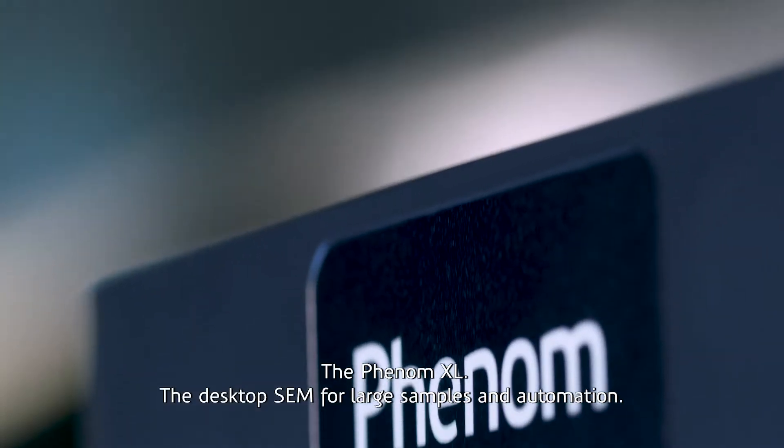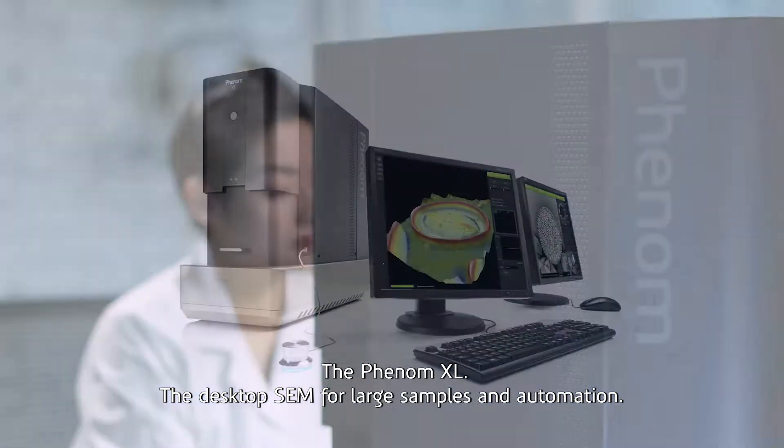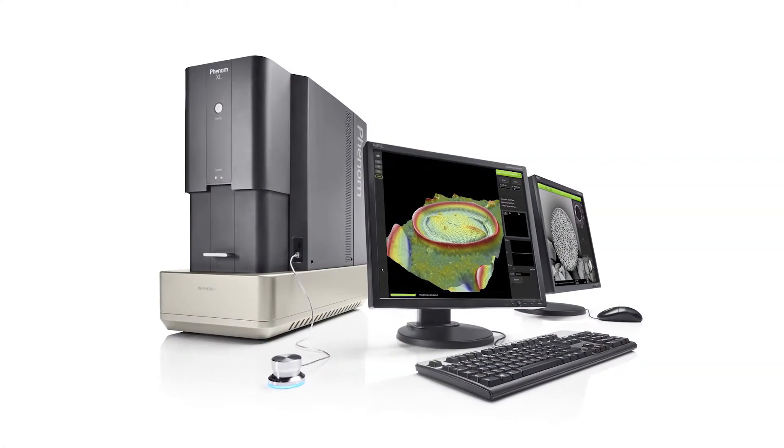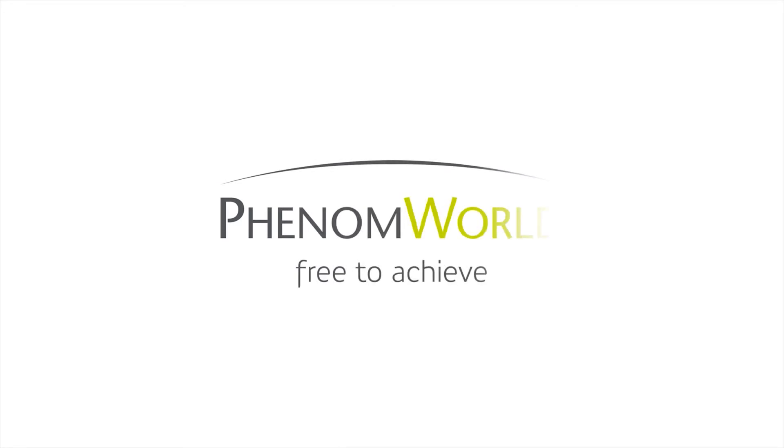The Phenom XL, the desktop SEM for large samples and automation. Phenom World, free to achieve.